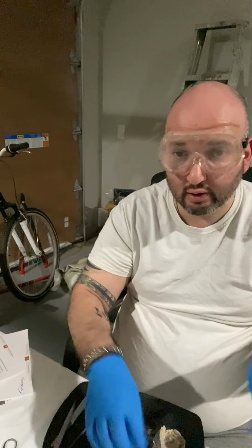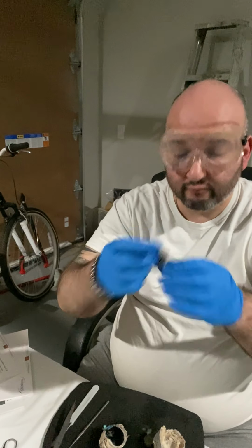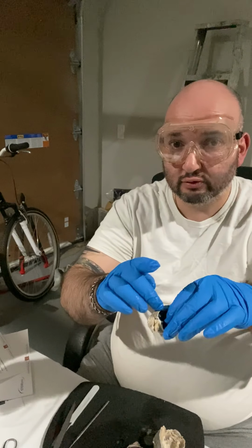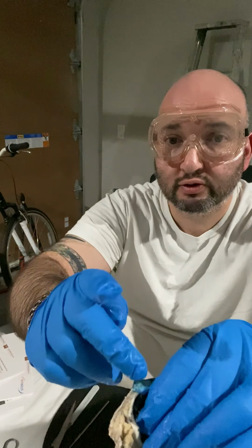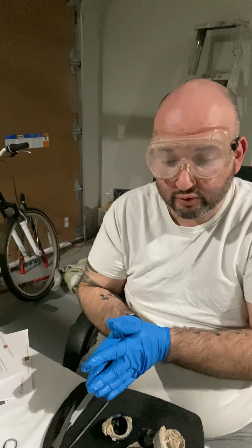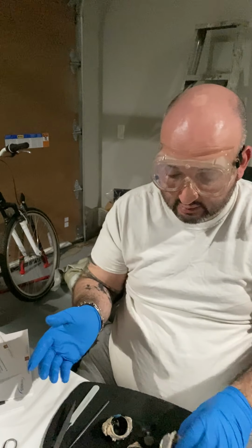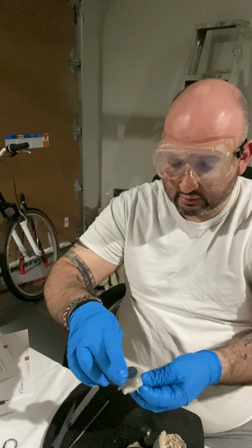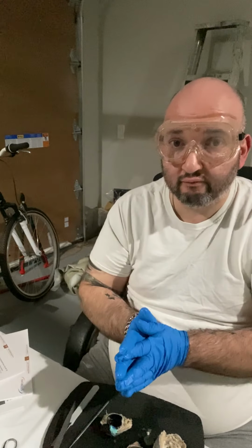This is also where the picture is formed. And then the choroid, this beautiful turquoise pigmented portion, is basically the vascular layer between the retina and the sclera. And the sclera is the white portion here. This is the sclera of the eyeball.